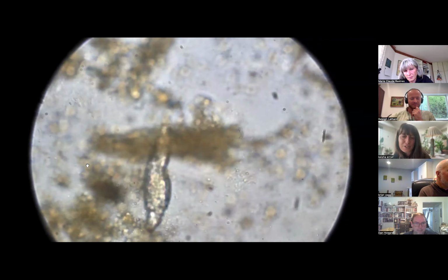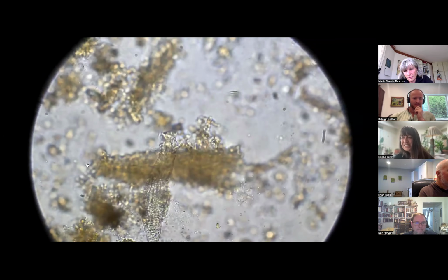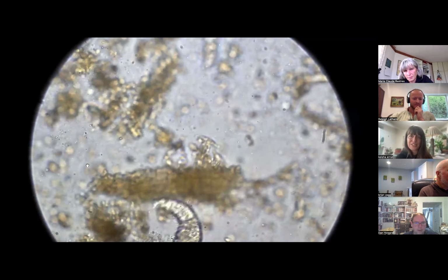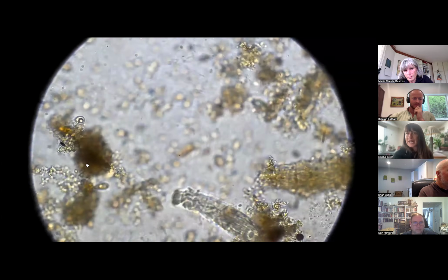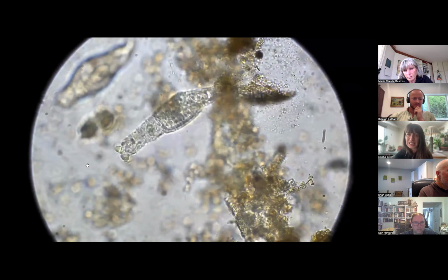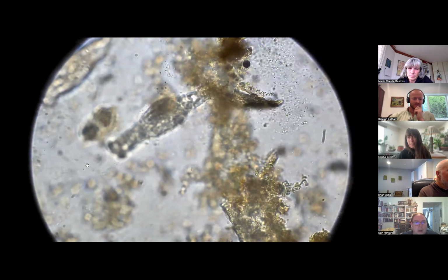If I've got some rotifers in place, I'm not super nervous about my worm bin. I saw somebody, Danielle, says, hey, I find rotifers in my vermicompost. Of course, vermicompost is super moist. There's little anaerobic pockets, and these guys will function at eating spirilla, spirochetes, all kinds of bacteria. So I see them as just powerhouse predators, similar to the way that I would see ciliates.